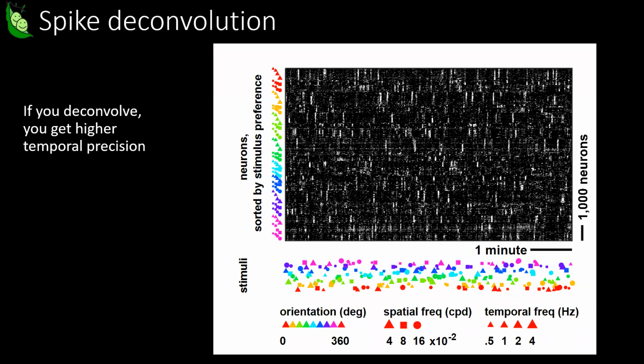Yeah, so I think suite2p is able to get all the peaks from the correlation map. What happens is there are cells that aren't on the correlation map, or have weak signals on the correlation map, that Cellpose might find. Particularly if you're doing recordings day after day and you want to get all the cells possible and look at learning across time, you might want an instance where you do get all the cells, whether or not they have strong activity on that day. So it might be able to pick up these cells with lower signals.